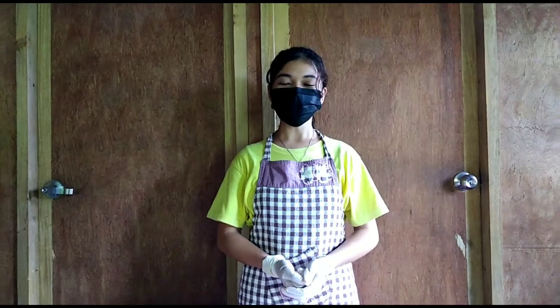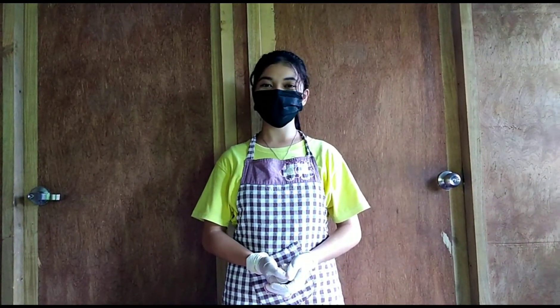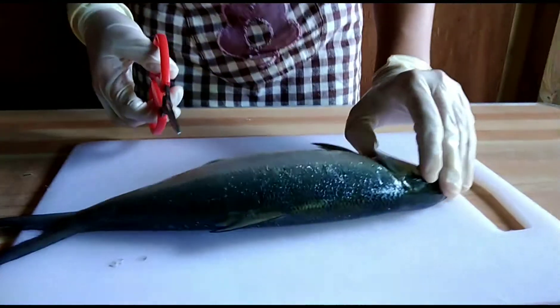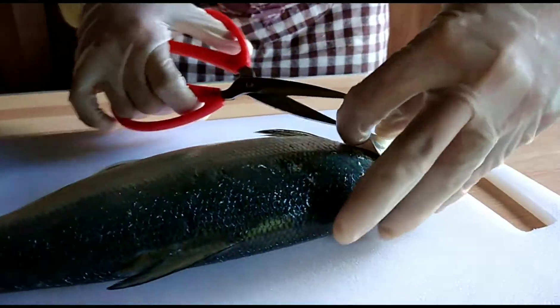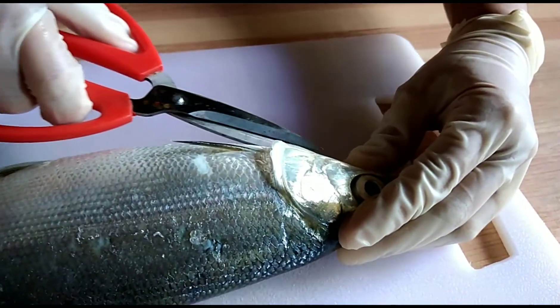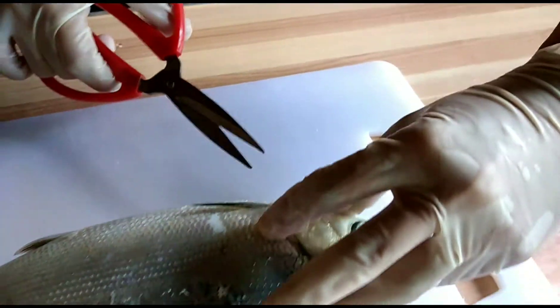First we have to cut the operculum, which is the covering of the gills. I am using scissors to cut the covering. Be careful in cutting this so it will not affect the gills inside.